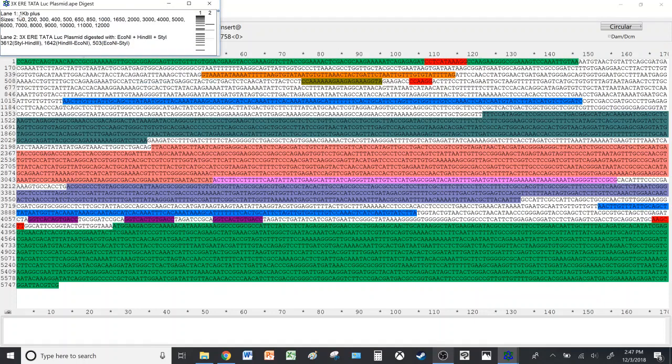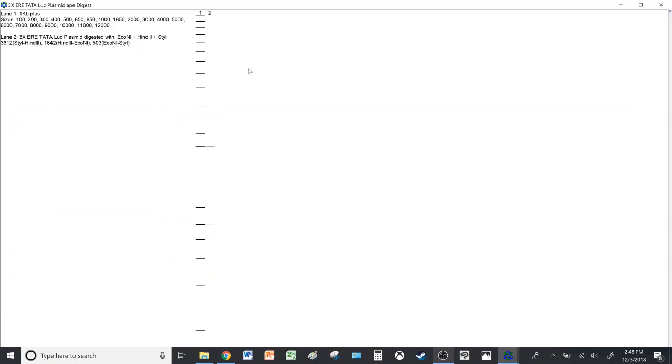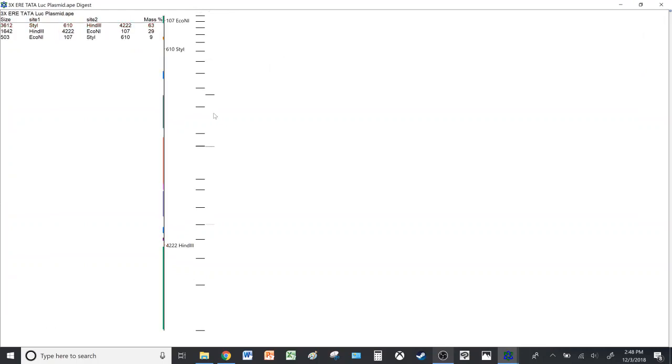So here it shows you lane 1, which is the ladder, and lane 2, the plasmid after it underwent restriction digestion. Let's enlarge this. So if you wish to know which band was created by which enzyme, you simply hover over it with your cursor like so.